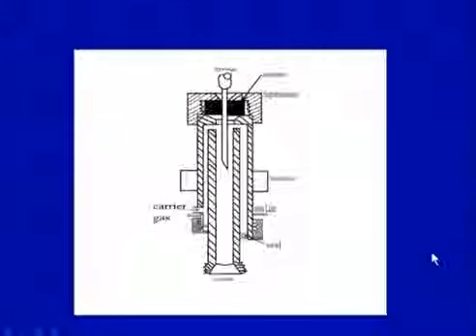Now, this is a very typical representation of a typical vaporizer, where you can inject the sample in here. As you can see on your screen, there is a syringe which injects the sample in here through a rubber septum, as I was talking to you, and there is a heat block here. If you can see, this is your heat block, and this is heated to a very high temperature, so that liquid could be converted to vapor instantly, and then once it is done, this will be flushed into the column, where it can then be separated. So, this is a typical vaporizer, you can say, a flash vaporizer.